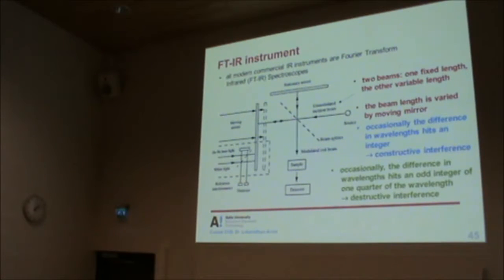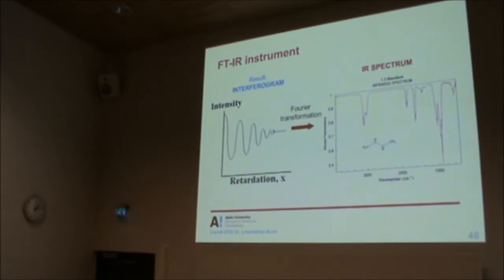Now the difference between this and the dispersive way is, here at one go you're sending all the frequencies that you need. So here you have intensity as a function of frequency, but in the case of dispersive, you will actually change the wavelength. At one time you send one wavelength at a time. The next slide, maybe it will become a bit clearer.